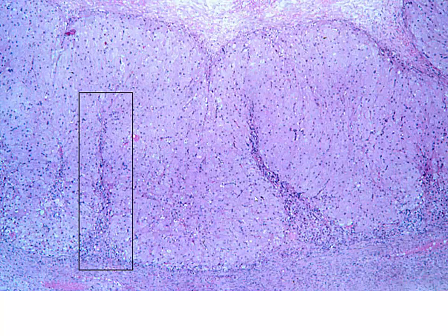This is fairly typical of what we see with a corpus lutea. You can see these granulosal cells all folded in nature. Here we're going to have some connective tissue septa that help divide these granulosal lutein cells into these folded structures. This is going to be the lumen, and here we'll have our theca lutein cells on the outside.